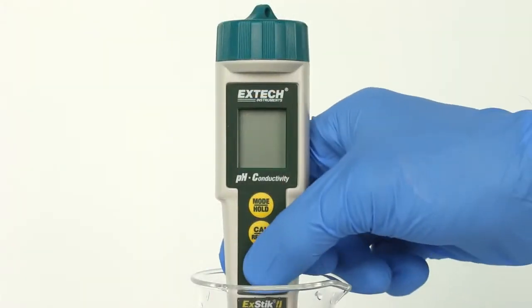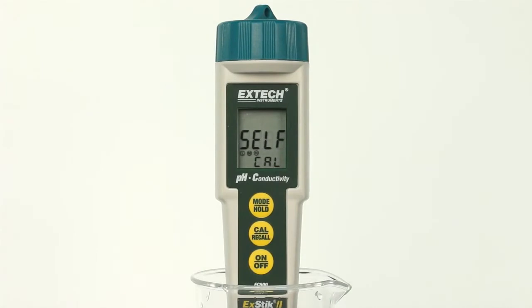Press the on button to turn the meter on. A self-check message will appear in the display during the turn-on diagnostics.